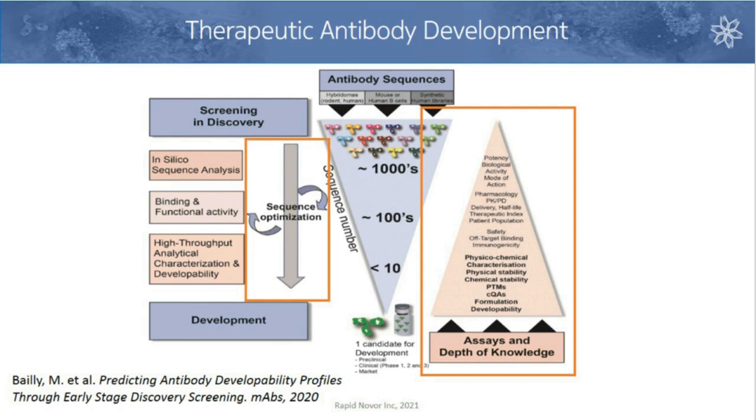Coming back to the point I made earlier about monoclonal antibodies of interest, it could be the case, if you look on the right-hand side, that assays are your game. You're working with PK/PD assays, trying to quantify particular metrics of interest, and you might just be looking to develop a monoclonal antibody if you can't already find one. Indeed, this is another area in which we've found quite a bit of interest. And coming back to the point about therapeutic leads, the sequence optimization aspect of this, this is an argument.